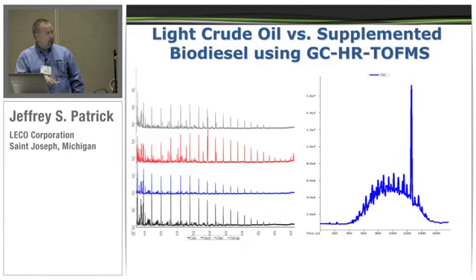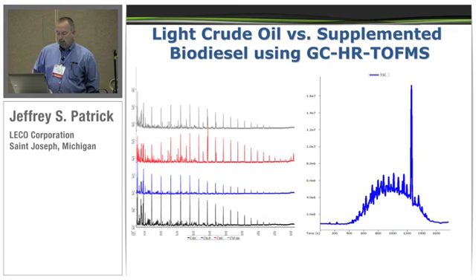This is just a comparison. These are like crude oils, and then this is a biodiesel, a supplemented biodiesel. Very different profiles and very different challenges.